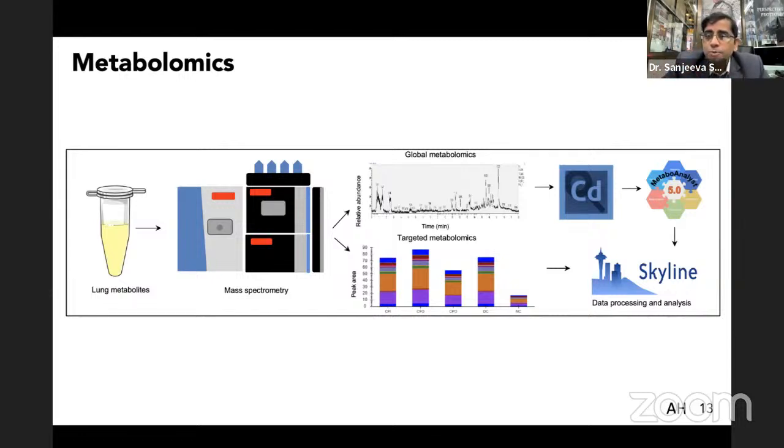Today's live session is also for the broader audience, talking about proteogenomics and multiomics. So now we want to expand your view. Think about generating, from the same sample, the next layer of information at the metabolite level. Metabolomics can be done using various types of mass spectrometers. The one we are going to show you is another Orbitrap Q Exactive, which is interfaced with the UHPLC. It is pretty straightforward, much simpler to do metabolomics as compared to proteomics. Of course, you need to optimize multiple parameters, and now Ankit is going to quickly demonstrate the metabolomics-based workflow directly from the lab.